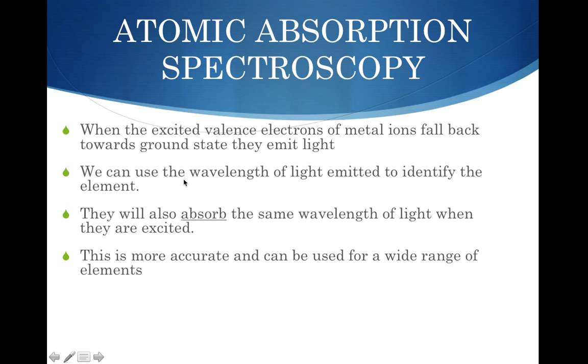Unit 2 Chemistry, Chapter 18, Part 3. Another way we can analyse salts in water is using a process called spectroscopy. And we're going to look at two different types of spectroscopy. One which is called atomic absorption spectroscopy, or AAS, and another one which is called UV visible spectroscopy, or UV-vis for short.